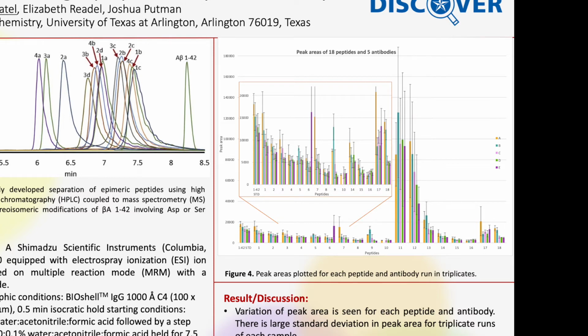There is a notable increase in peak area at peak 11, which is actually likely due to the use of a new chromatographic column. This large increase in peak area shows us that there is likely a systematic error that is resulting in irreproducible results. There's also a subsequent decline in peak area, likely due to protein buildup in the column.